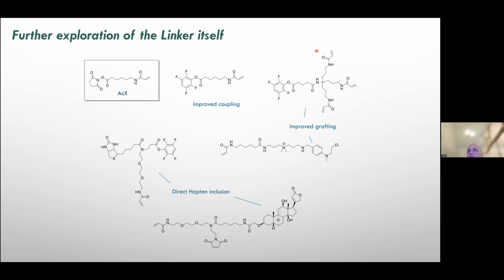We've also made variants where you have 3 acrylates. I've shown you that this will get you better grafting to the gel of your target, especially when you have something where there's only one linker on there. We've also made linkers for direct nucleic acid targeting. This is, for example, one of the linkers used in the ISH approaches. Here you can see a charged backbone. This charged backbone linker will allow for charge effects. This positive linker will like the negatively charged nucleic acids, will ensure fast binding and very efficient grafting.